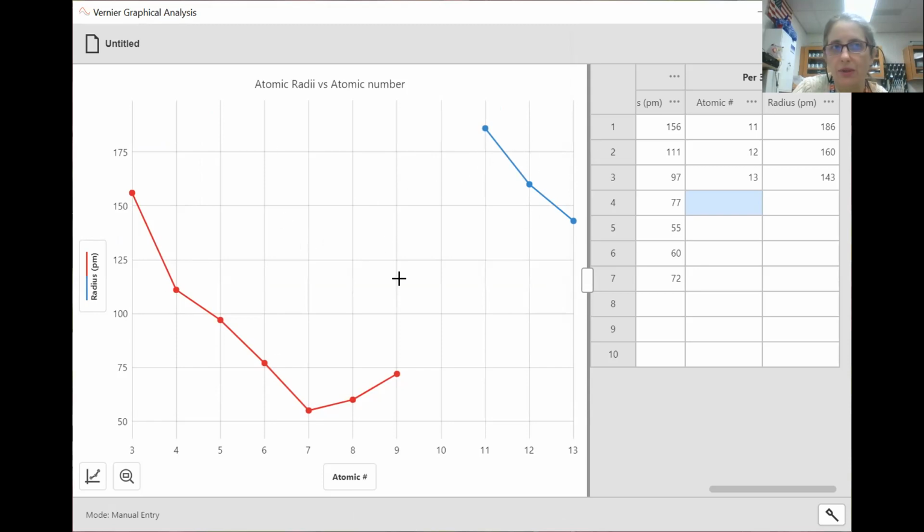So again, it's a pretty nice, simple program. I think the trickiest parts are the ones that I kind of showed you in this video. So hopefully that will help you in graphing.